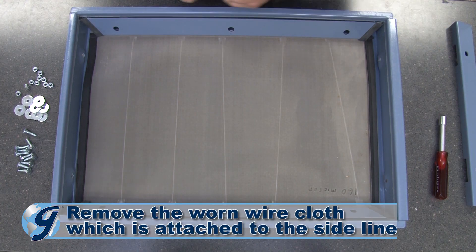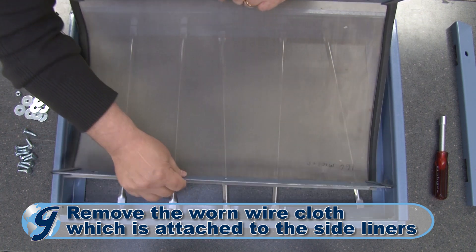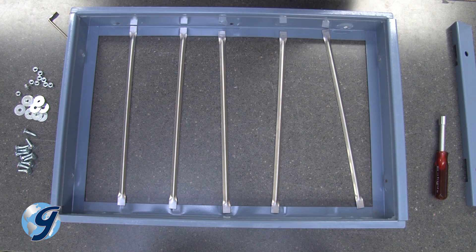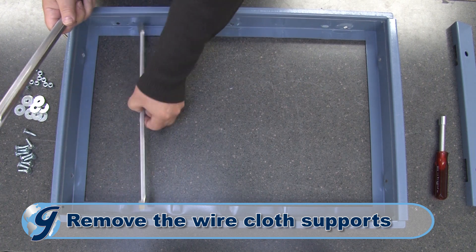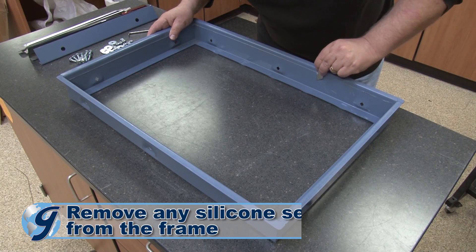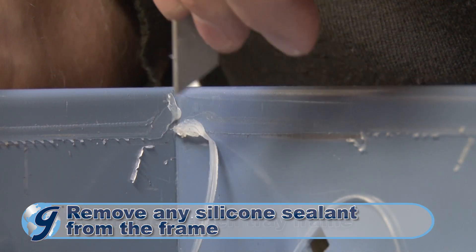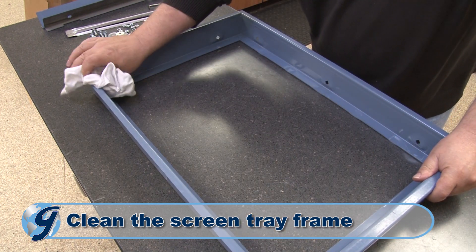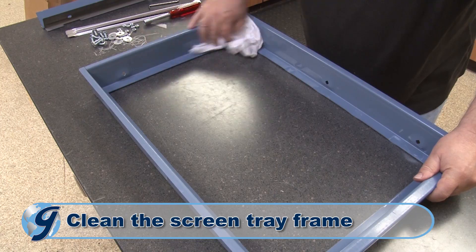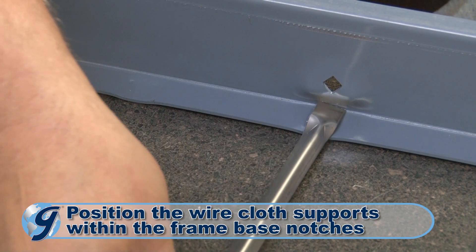Take the wire cloth, which is attached to the side liners, out of the screen tray and set them aside. Next, set aside the wire cloth supports. Now remove any silicone sealant from the frame and clean the screen tray frame before installing a new wire cloth. Position the wire cloth supports within the notches on the screen tray frame base.